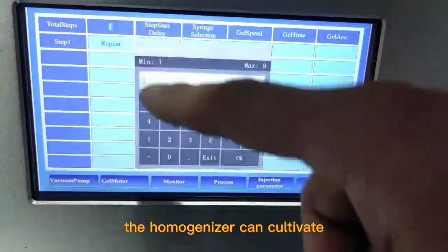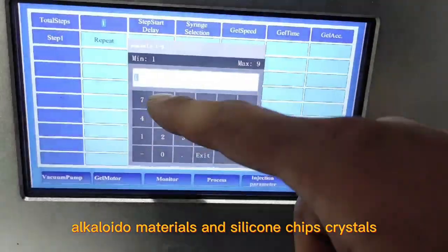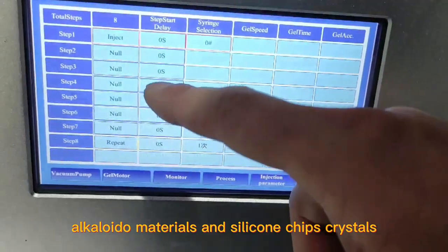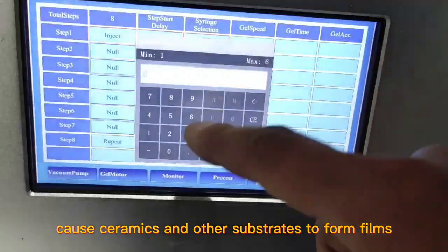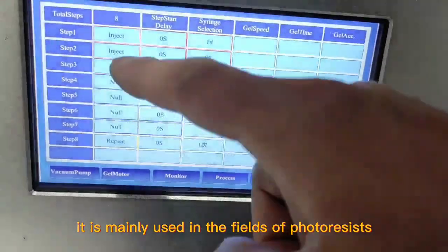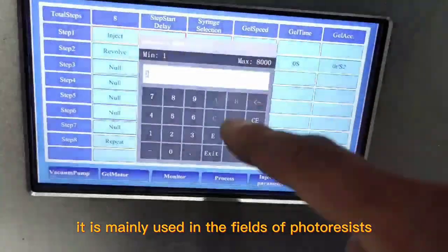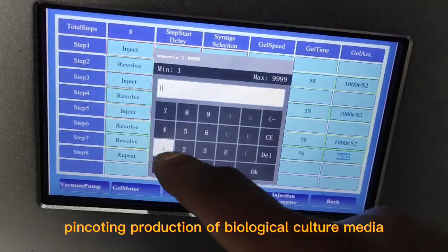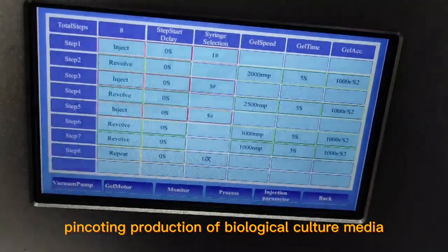The homogenizer can coat liquid colloidal materials on silicon chips, crystals, quartz, ceramics, and other substrates to form films. It is mainly used in the fields of photoresist spin coating, production of biological culture media, and production of polymer films by sol-gel method.